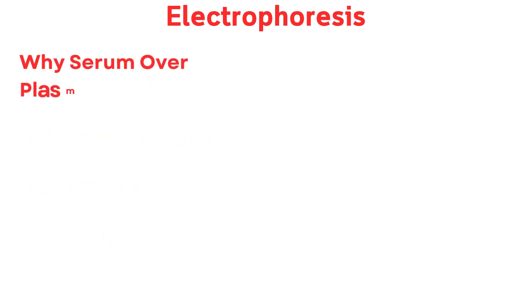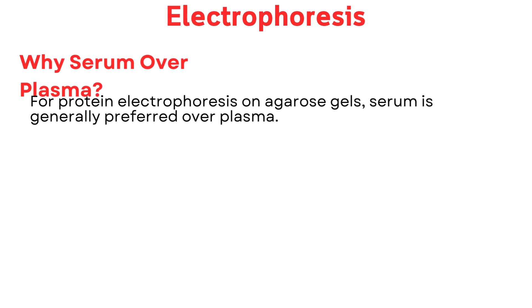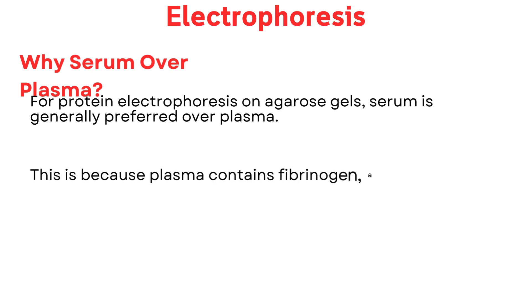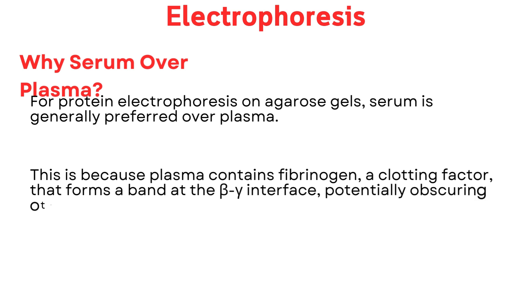Why serum over plasma? For protein electrophoresis on agarose gels, serum is generally preferred over plasma. This is because plasma contains fibrinogen, a clotting factor, that forms a band at the beta-gamma interface, potentially obscuring other protein bands.